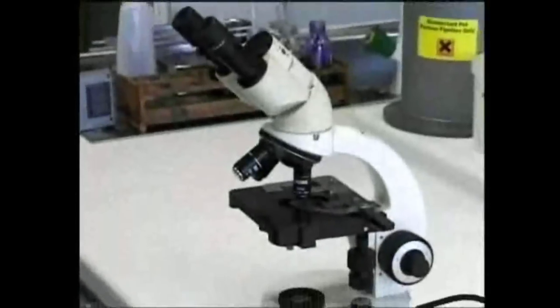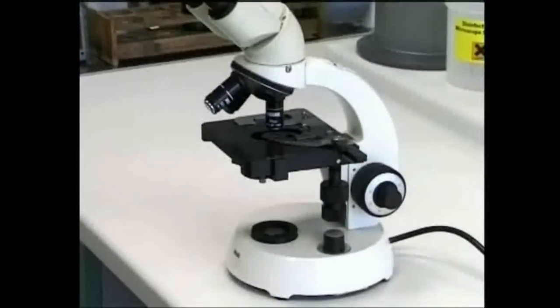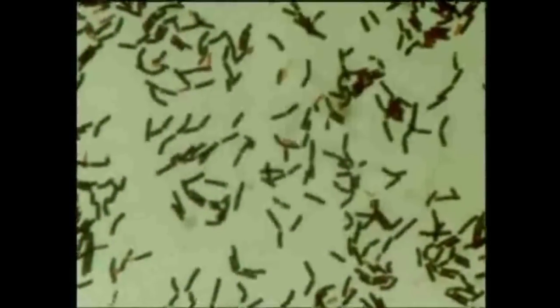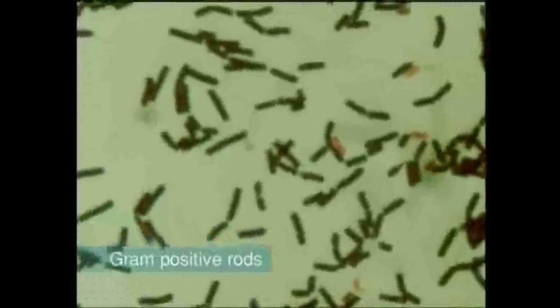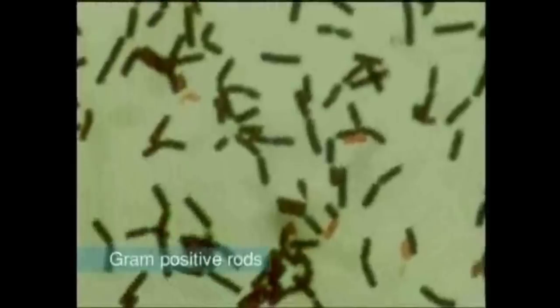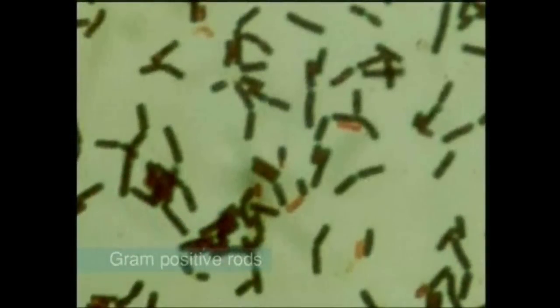If you want to look at individual bacterial cells rather than the growth of cultures, you'll need to use a microscope. The gram stain is the most important stain in bacteriology. It divides bacteria into two groups, called gram positive and gram negative, and provides an important initial identification step.